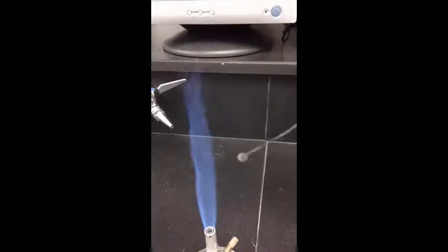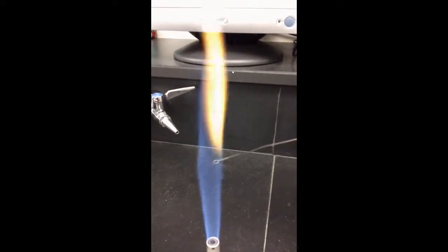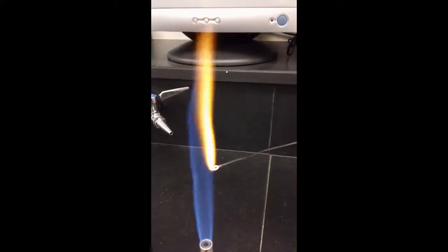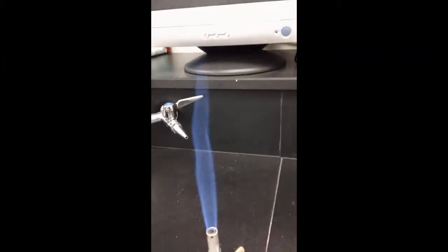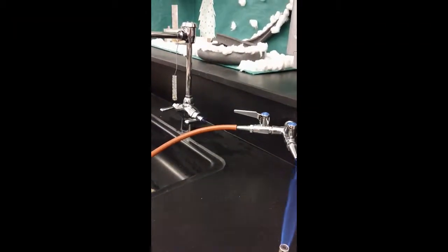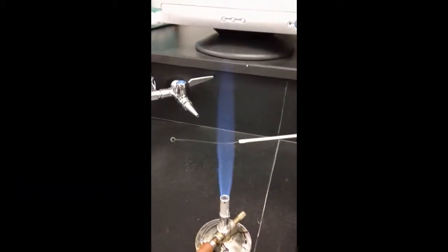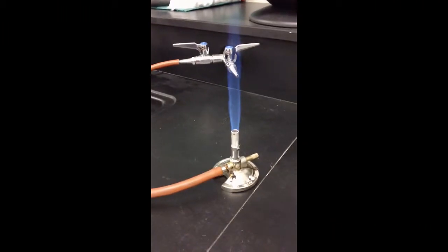And so I put it in there, make sure I have a full bubble. Come over here. Gotta get that full bubble. Again, super quick. I'm gonna do it one more time so you can see it. Every once in a while you want to wash it off, make sure that we're clean. So I'm just cleaning. Okay? So I'm going to stick it back in the ZN.